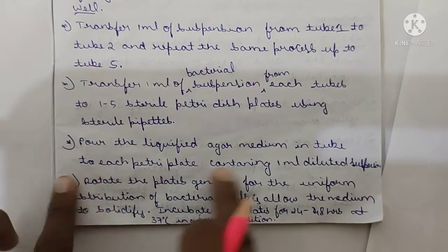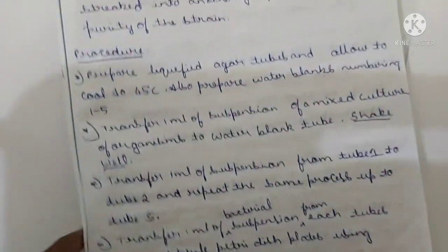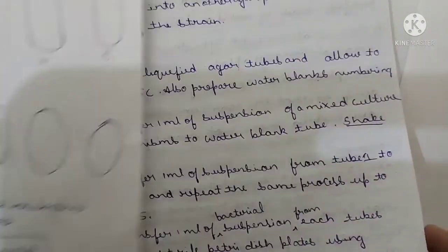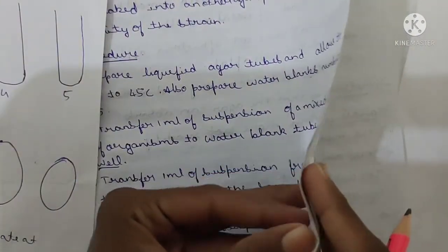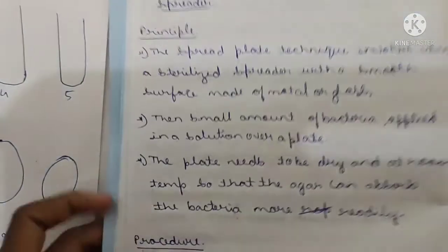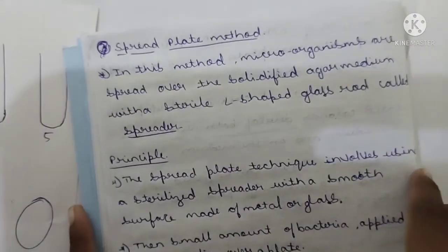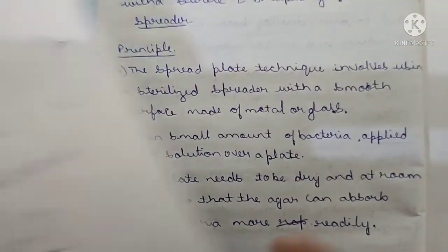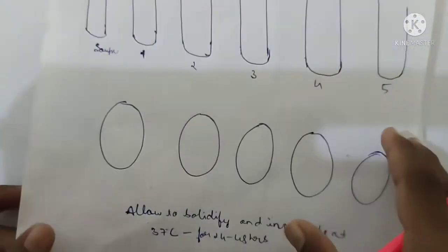It is a very important point. Okay, we have to follow the whole procedure correctly. Only then will we get a pure culture. Got it, my dear brothers and sisters? Yes. Now see, it is one type of culture method, that is a pour type of method. It is the pour plate method.